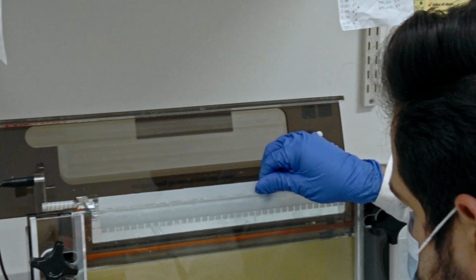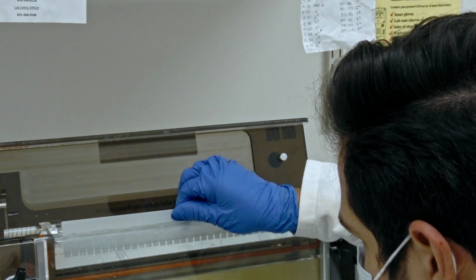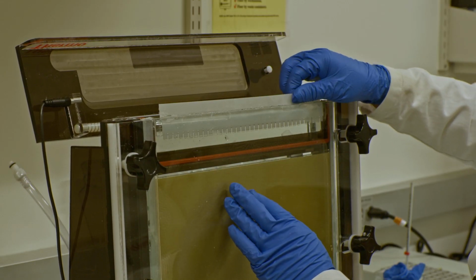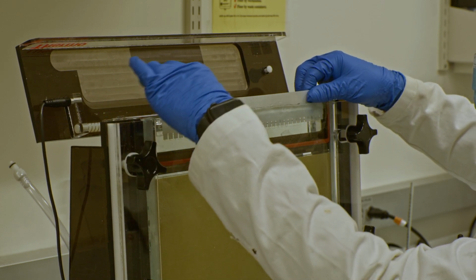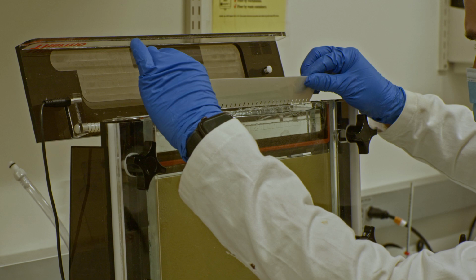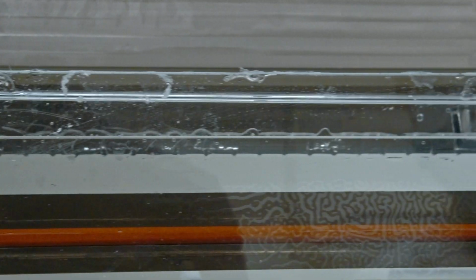Again, pull back a little bit. There we go. Okay. Using my other hand over here, just to help pull a little bit of it up. And there we go. Now we got the comb out of the gel. And so now we've exposed our wells. Our wells will be fine. A bunch of the wells are lopsided currently, but they'll be fine. They'll fix up as soon as you start running the gel.